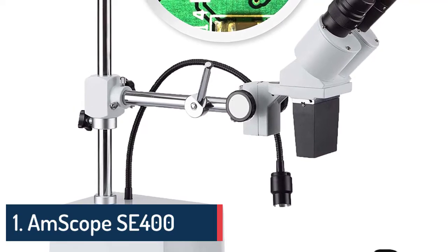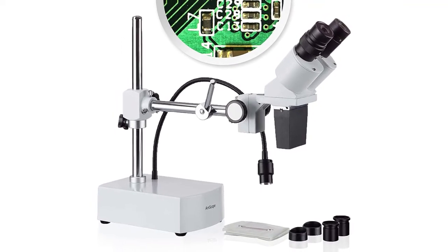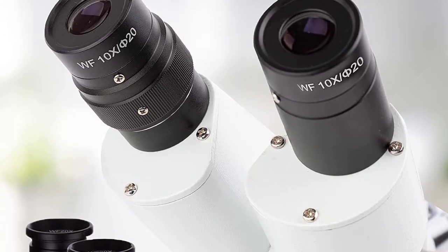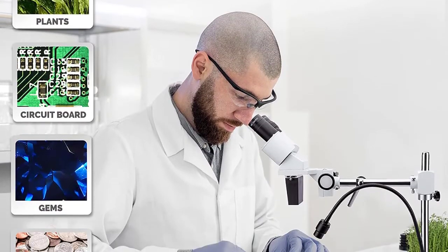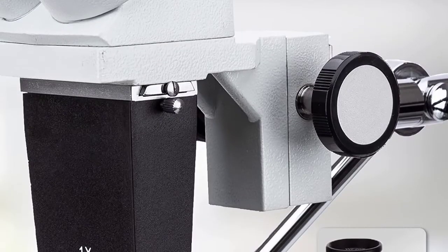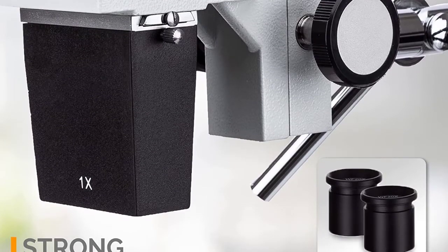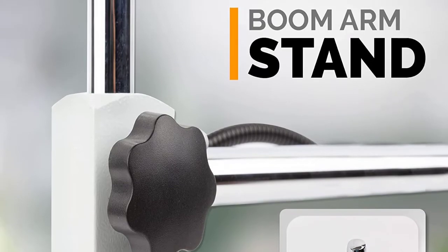Number one: AmScope SE-400Z professional binocular stereo microscope. WF10x and WF20x eyepieces, 10x and 20x magnification, 1x objective, LED lighting, boom arm stand, 110V-120V. Material metal, color silver, white, black. Item dimensions 17 by 16 by 8 inches.